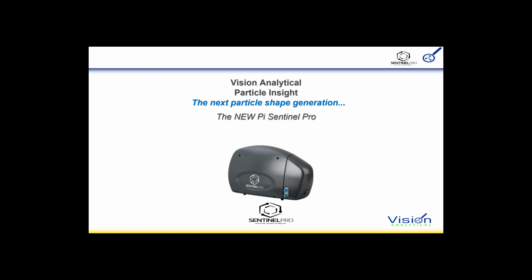There are 32 shape modules to classify particles with the best selected parameters. Shape analysis and the 32 shape display distributions are done in real time as images are captured, giving users instant results the moment analysis begins. The system can suspend particles in both aqueous as well as organic solvents.